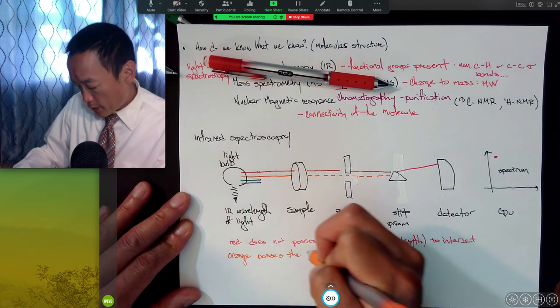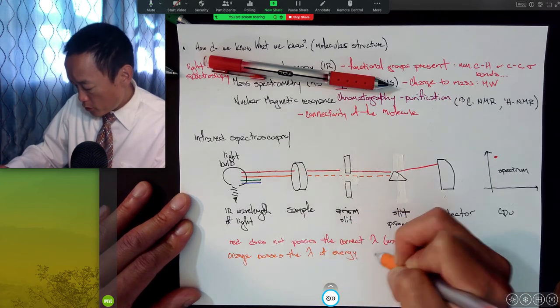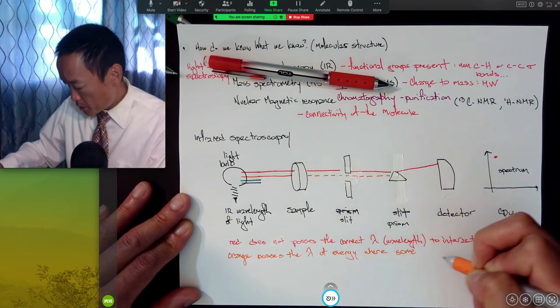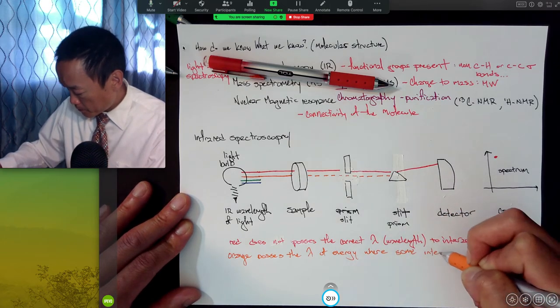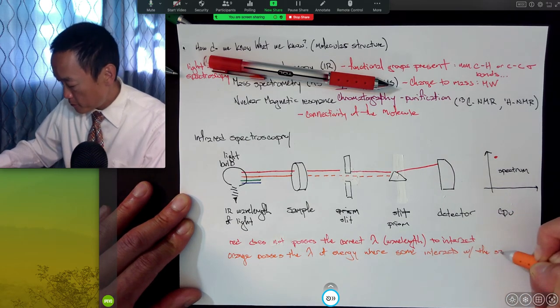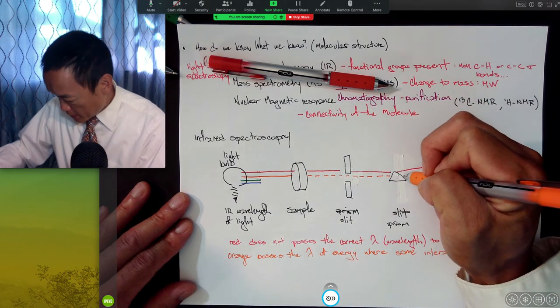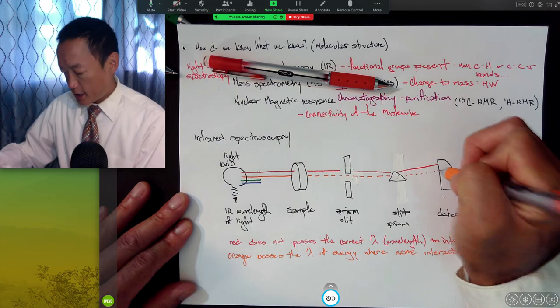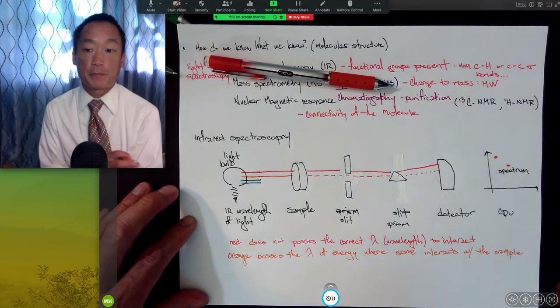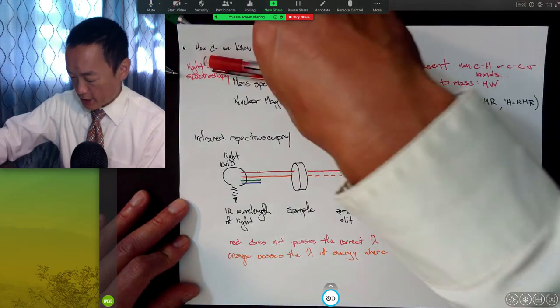And so the idea is orange possesses a wavelength of energy, where some interacts with the sample. It hits this slit in the prism, and it gets deflected, and it hits our detector, and that's going to appear somewhere else in our spectrum, right here. I know that doesn't look as clear as a dot, but you guys can get through.